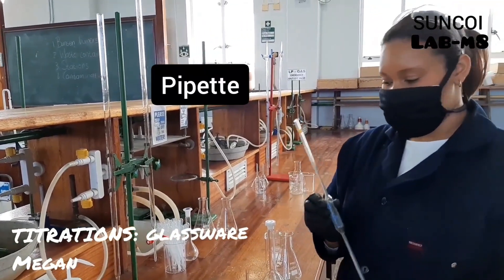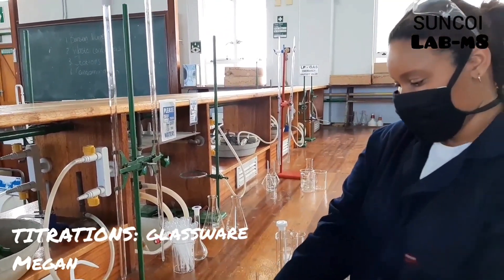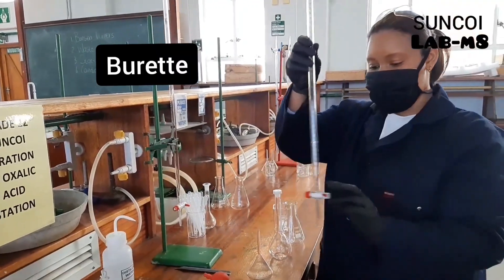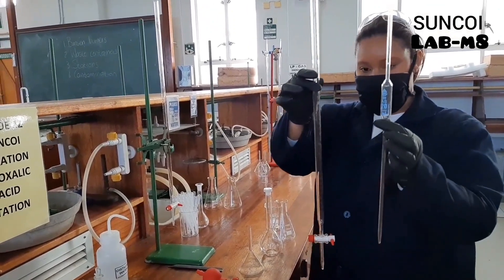This is a pipette. We use this with a pipette bulb which we attach over here. We also have a burette which comes with a tap. Notice the difference between a burette and a pipette.